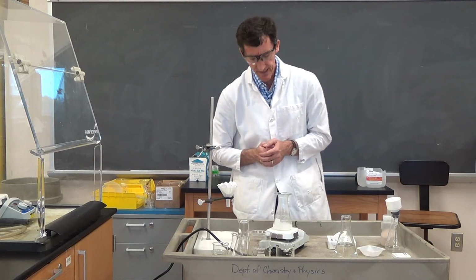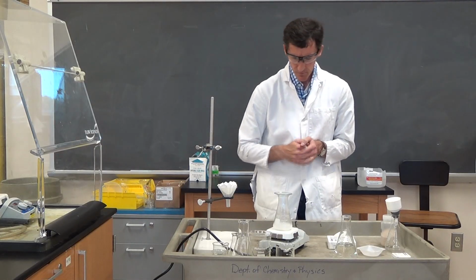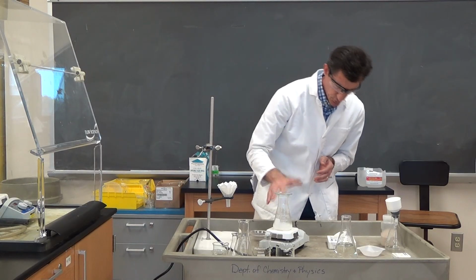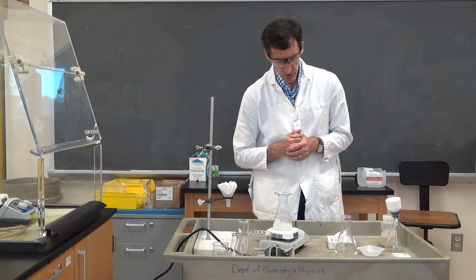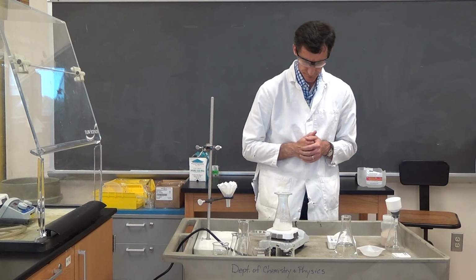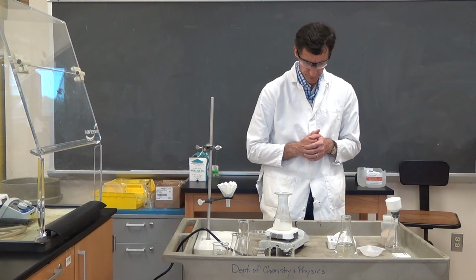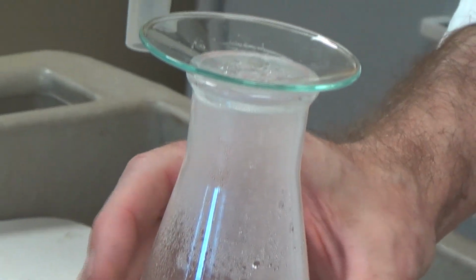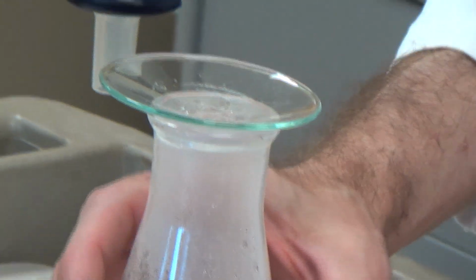How much more solvent to add? Well, it looked to me like half of the compound had dissolved. I started with about 20-25 milliliters. So to get the other half dissolved, I added another 20 to 25. That did cool it off a little bit. It's going to take some time to get back to boiling.